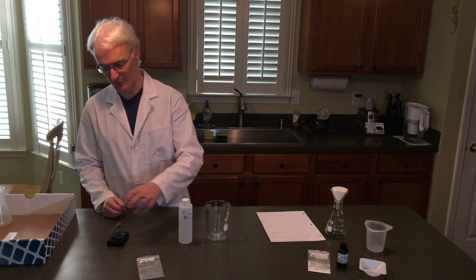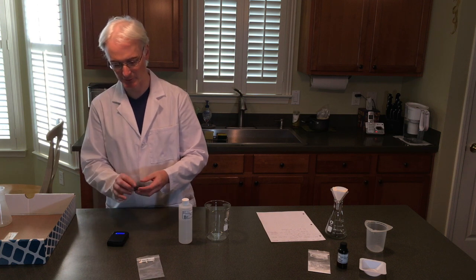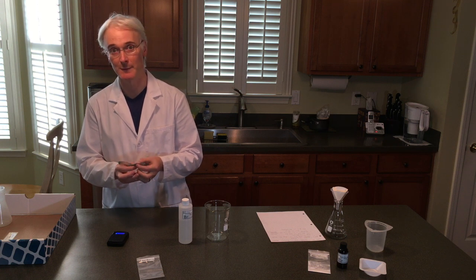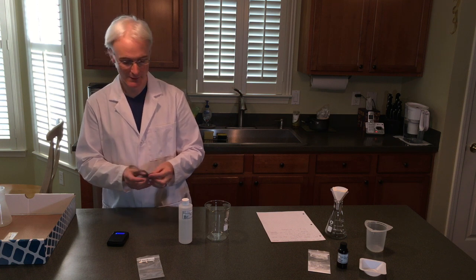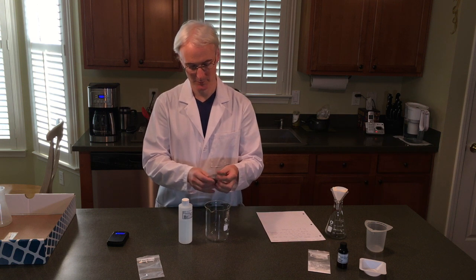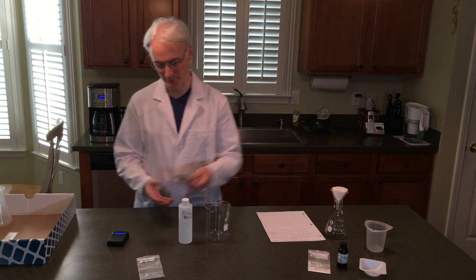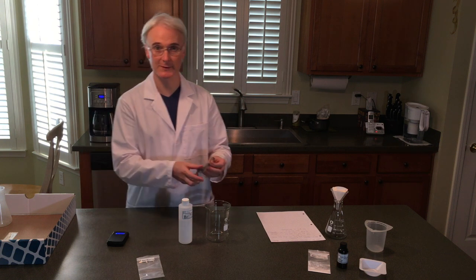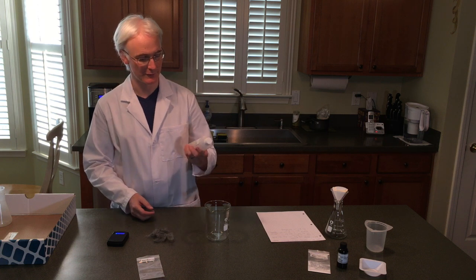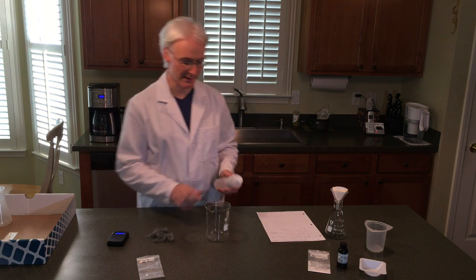They measured it precisely when they were packing, so we have 1 gram of steel wool. Don't presume that it is 1 gram even though it says it on the label. So we're going to take the steel wool and put it in here after we've put in 150 milliliters of acetic acid.